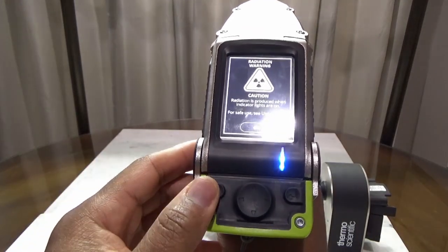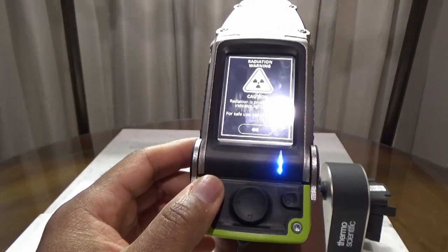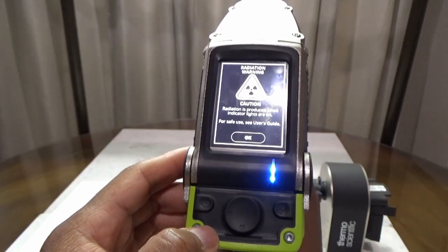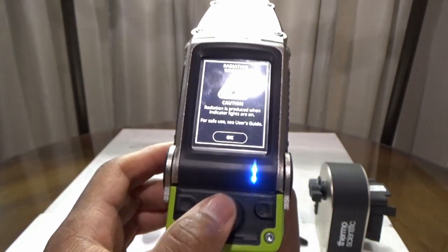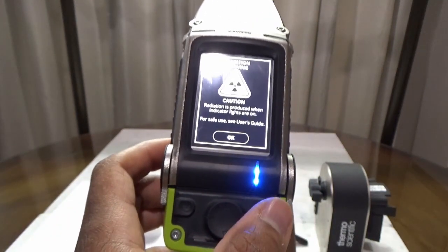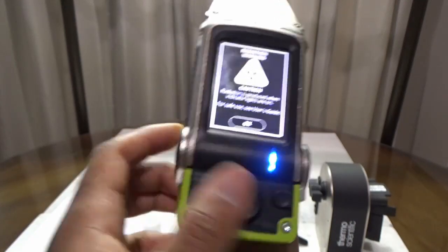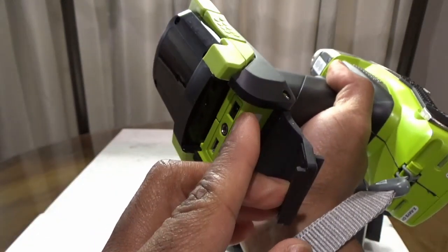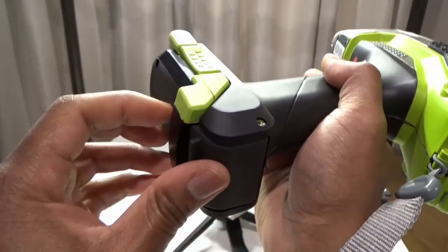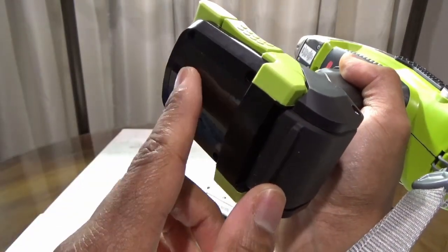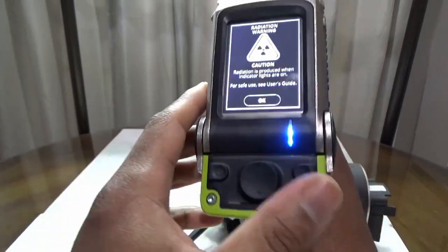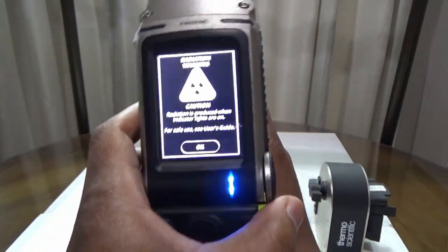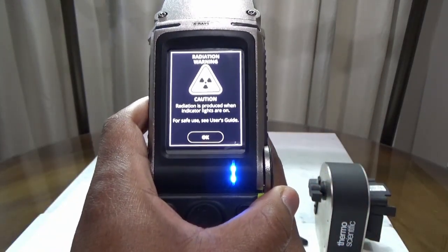The analyzer's power button is located on the left for turning the instrument on or off. In the center is a four-way directional pad for menu selection, and on the right is the enter button. On the back of the instrument are ports for both power and data connection. The analyzer also uses a five-second hot swappable battery pack to provide power. The analyzer may use a power plug connected to a wall outlet during extended use.